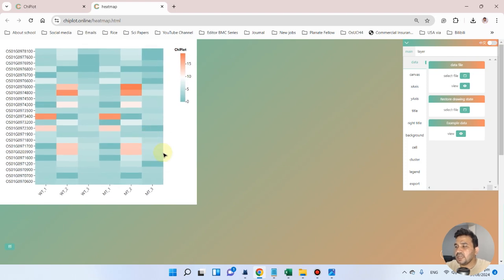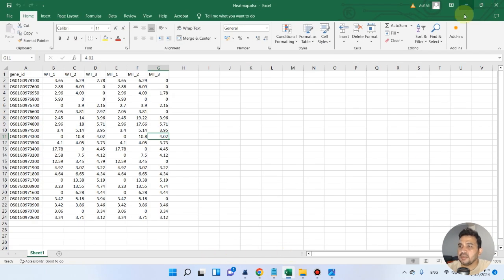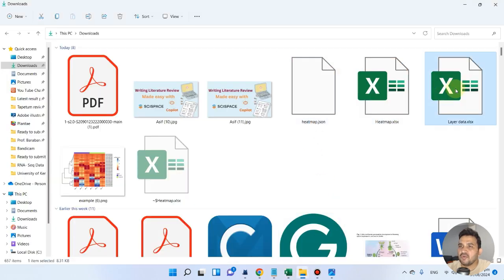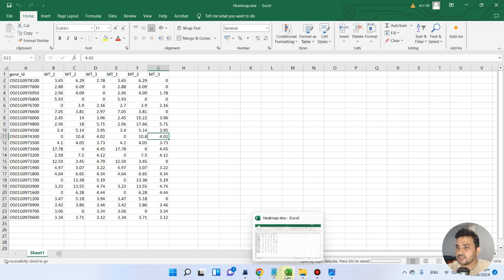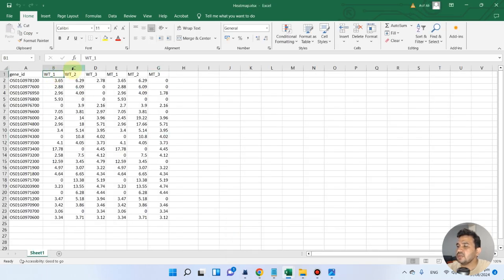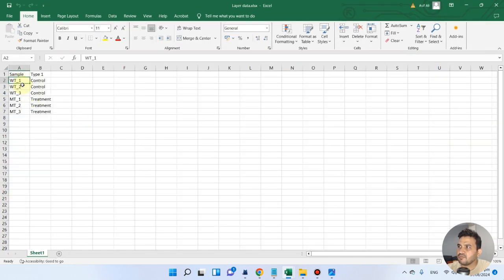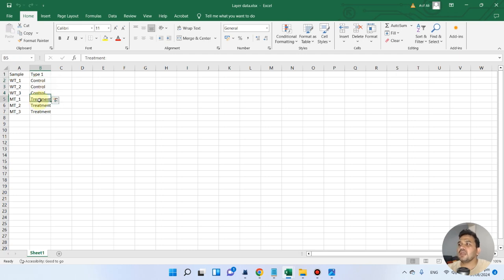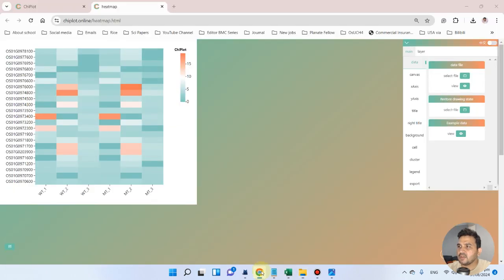Now we need to add one more layer to provide information about the samples. Let me go back and show you another file I have prepared. We have six samples — wild type 1, 2, 3 and mutant type 1, 2, 3. Wild type was used as control and mutant type as treatment. I have saved this file in Excel format.